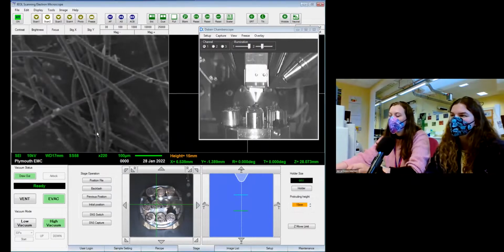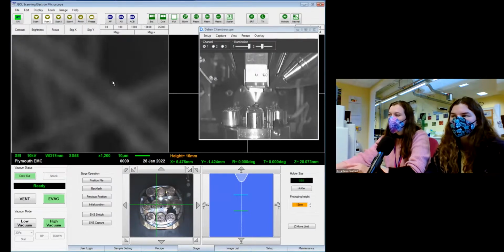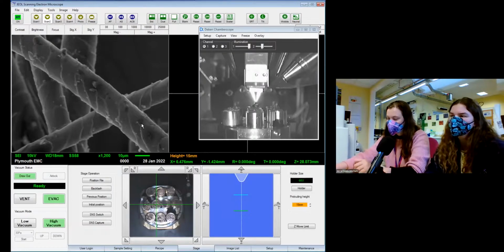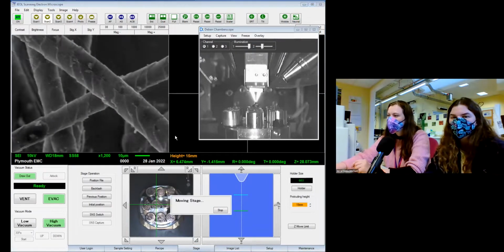What we want to do is try and make everything as conductive as possible. Carbon is really good at conducting things, which is why carbon nanotubes are really important these days. The benefit of the sticky carbon tack is it works like blue tack. If you've got a thing that's a weird shape or doesn't have a flat surface you can stick down, you can blue tack it down. You can put blue tack itself into a microscope, but it has to be brand blue tack. The knockoff blue tacks don't work as well apparently. It's just a good way to stick down things that aren't a sensible shape. You can use other things as well. We use silver dag, a silver paste, in the lab too. Normally anything conductive works, but carbon is easiest and cheapest, and works really well.